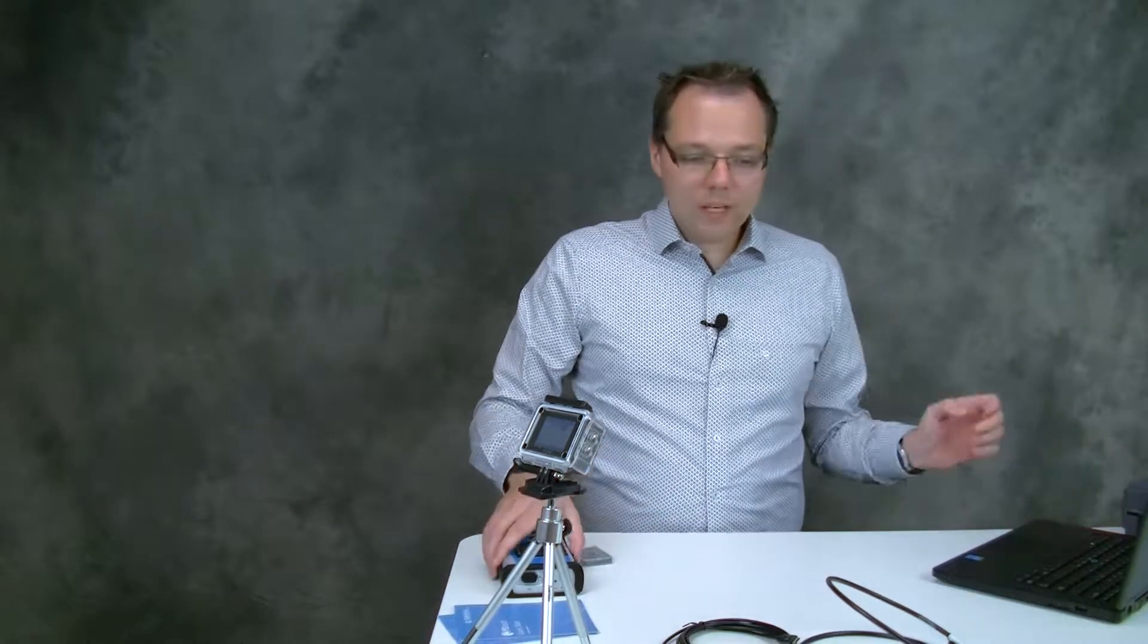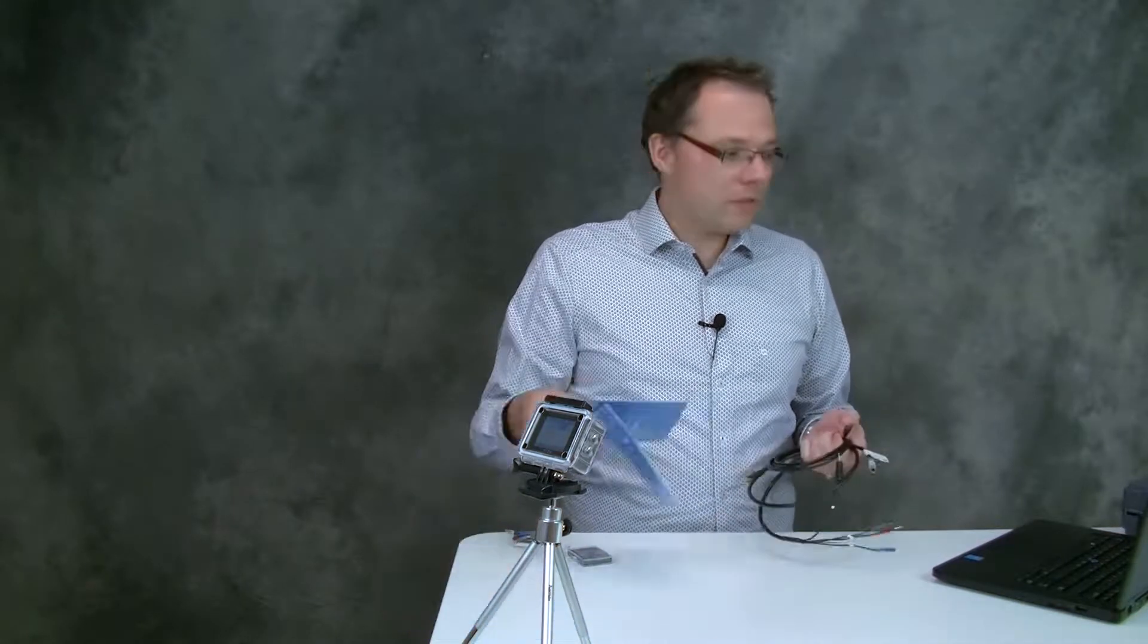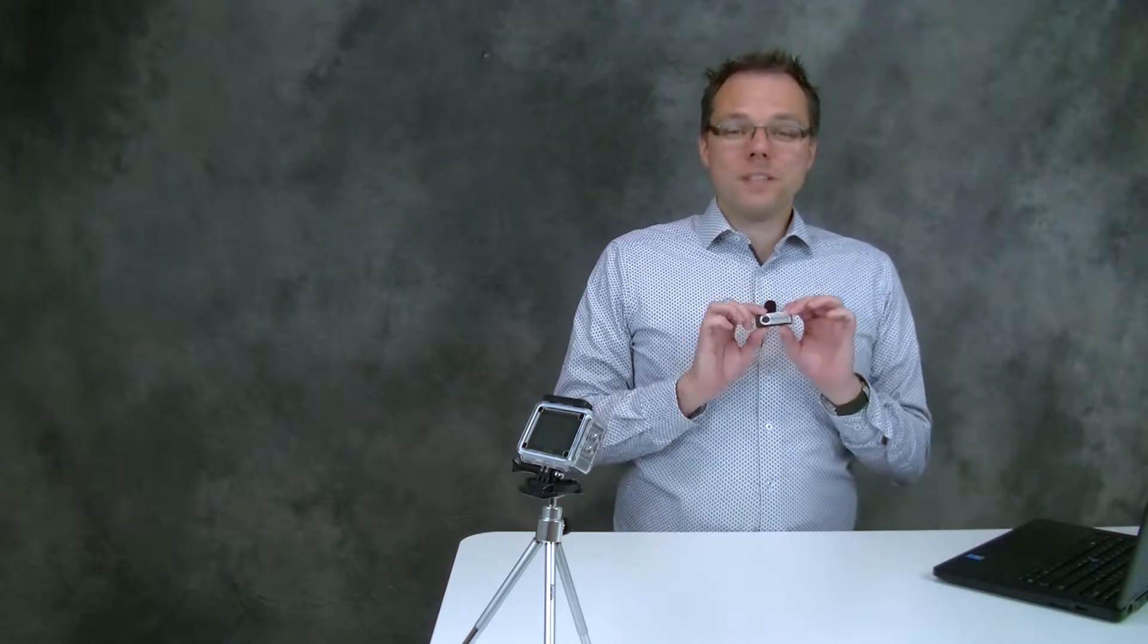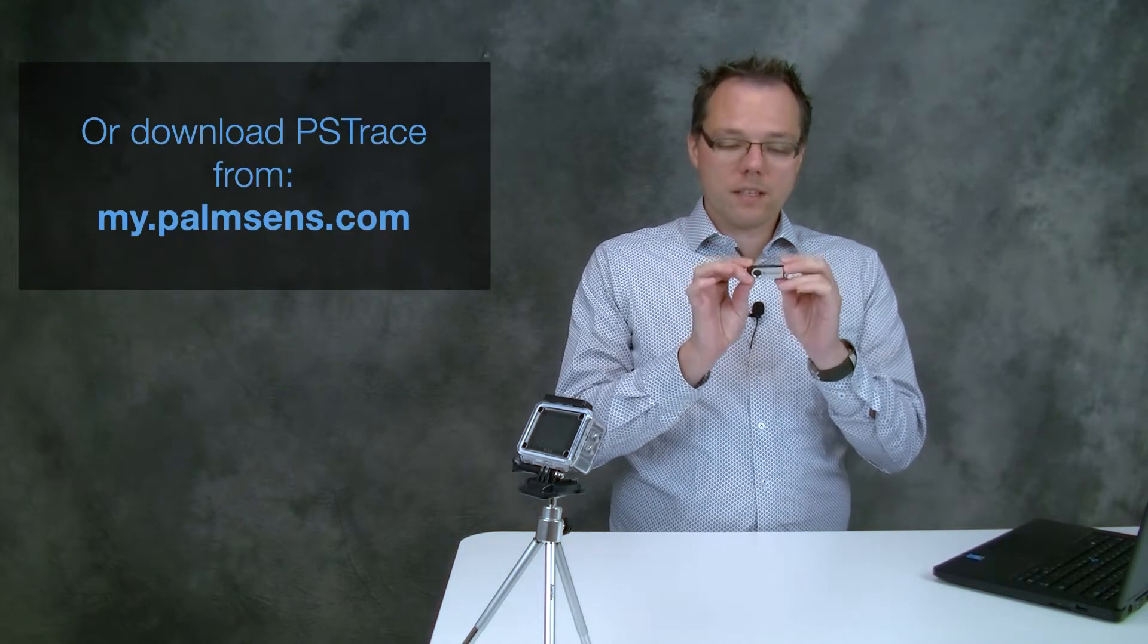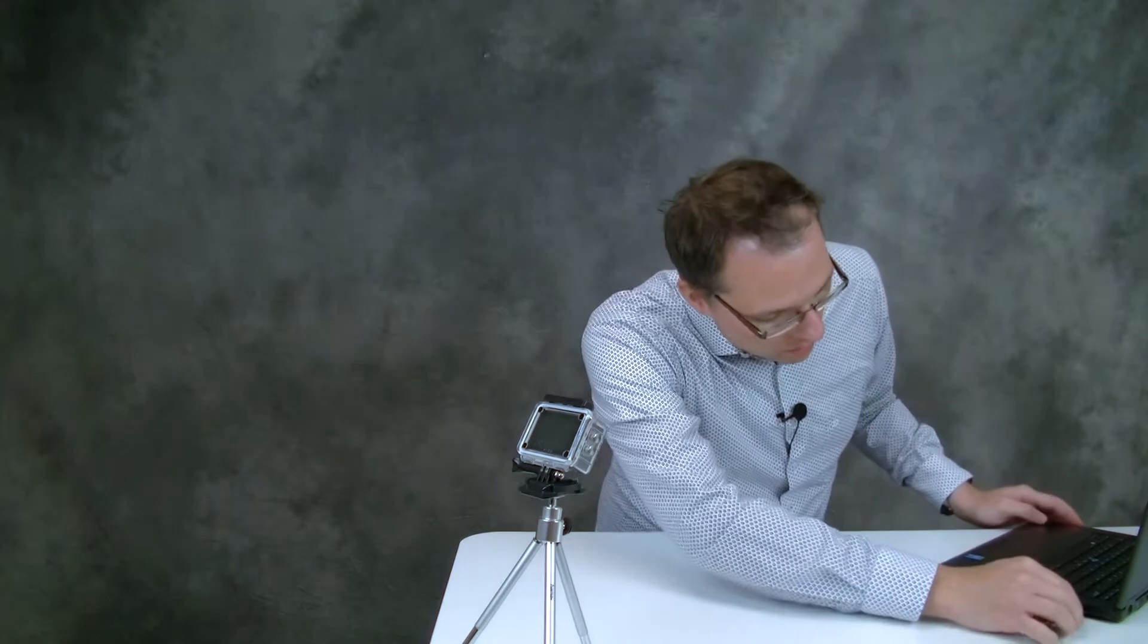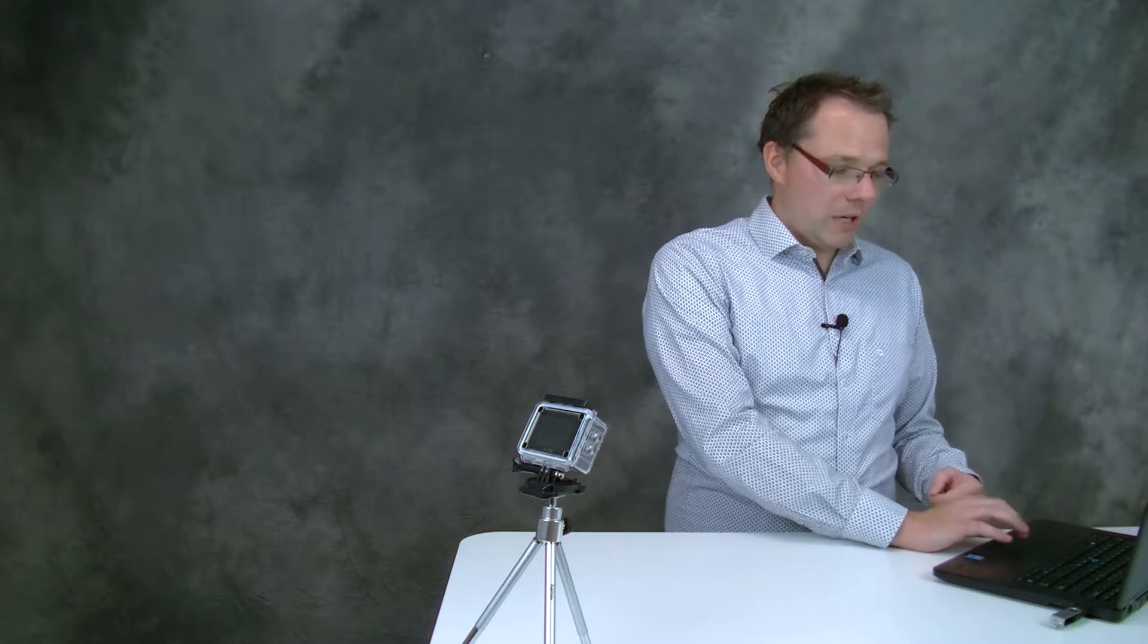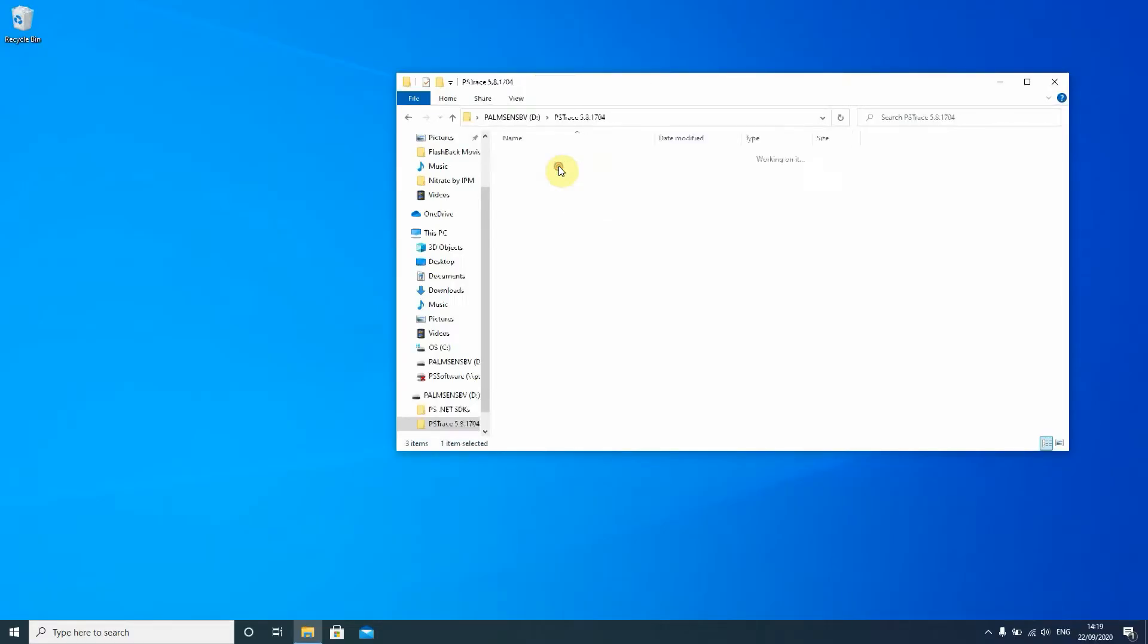Well before you can start using your very good potentiostat that you have just received you first need to install the software PS Trace. With this instrument comes a USB stick. On this USB stick you can find the software required for the Potentiostat and we're going to install this now. So you just push the USB stick into the computer that you want to use.